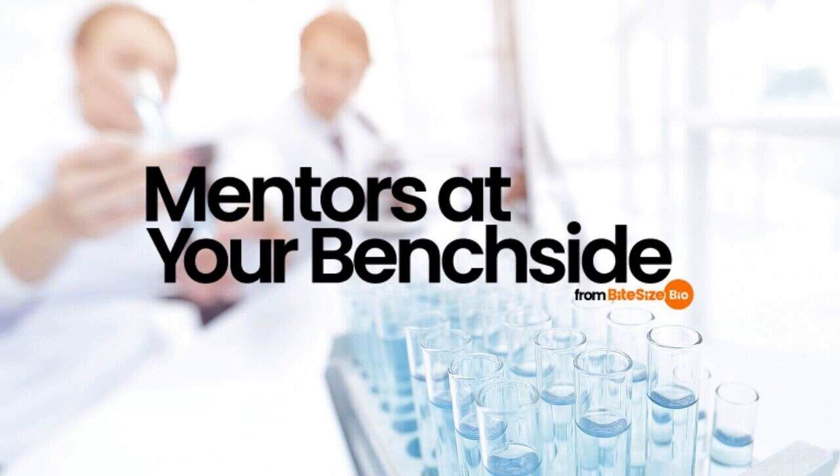For example, to know that staining is real and not due to autofluorescence or non-specific staining, you need to include no primary antibody or isotype controls in your experiment. Including controls makes your data interpretation easier and helps narrow down the list of issues when troubleshooting, for example, when you get no signal.